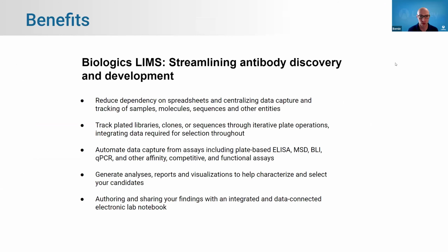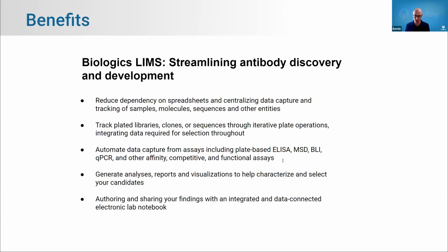Just to reiterate a couple things really quick. I showed you only a few aspects of our biologics LIMS. I wanted to make this succinct, but I also want to re-emphasize some of the main benefits that come from the efficiency gains in streamlining your antibody discovery and development. The first one that I really like to harp on is this reduced dependency on spreadsheets and working in a centralized place, which reduces error and the time required to track and report on your operations.